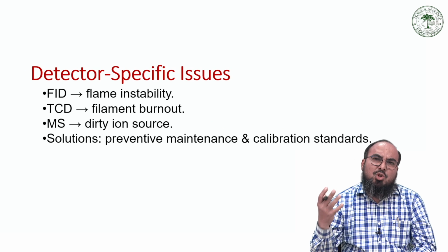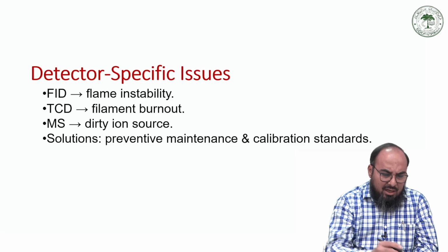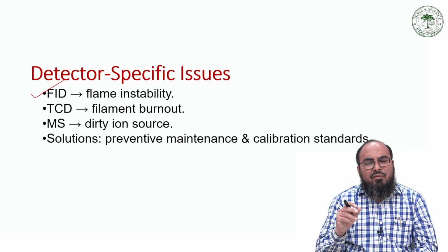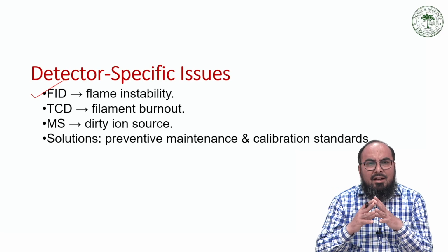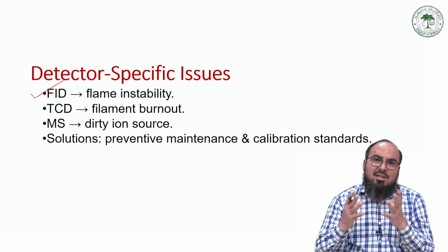Now there are certain specific issues with specific detectors. For example, FID was a very good detector in terms of sensitivity and linear response. It was exceptionally good. But the problem is that it works on the principle of combustion, because it is a detector which burns the sample.